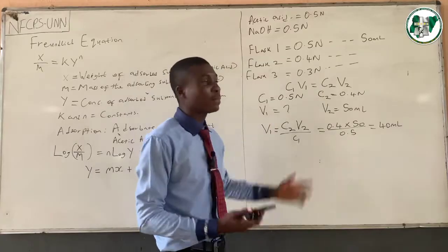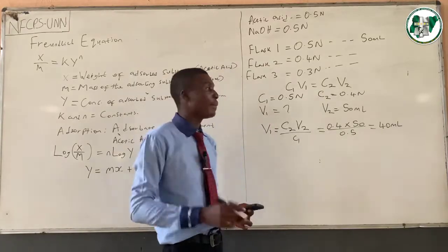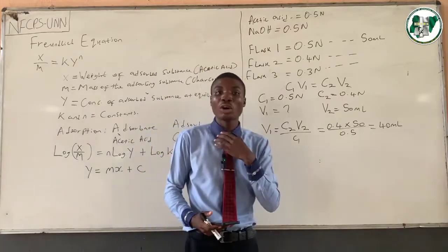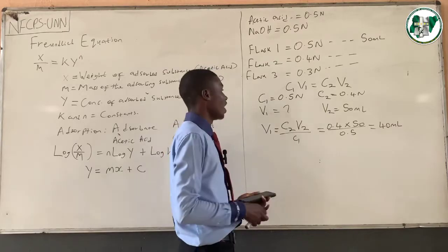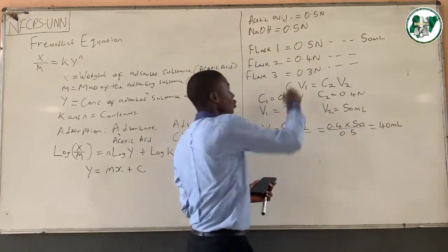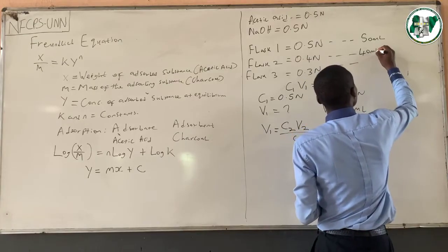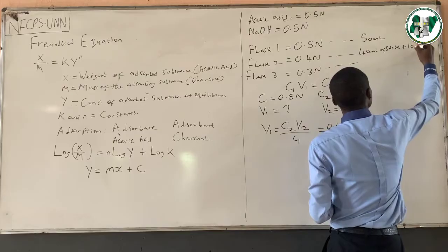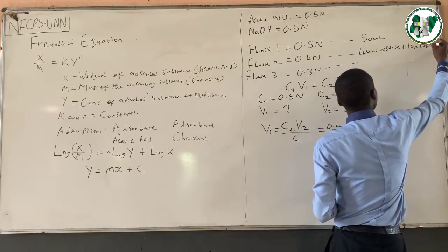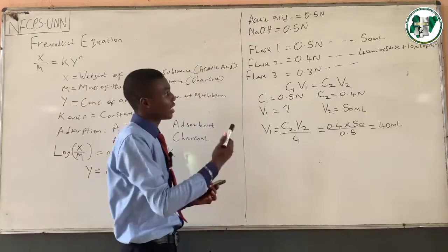So I'm going to be working this part. You see the other part there. Any of them you choose, you go that way. But the idea behind it is to show them that you know exactly what you are doing in this particular experiment. So 40 mL of the stock solution simply means 40 mL of stock plus 10 mL of water, that's H2O.